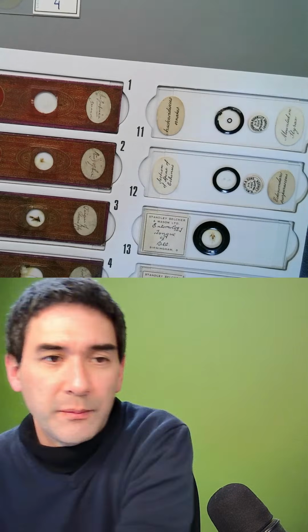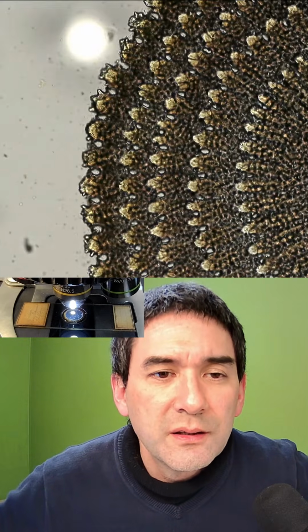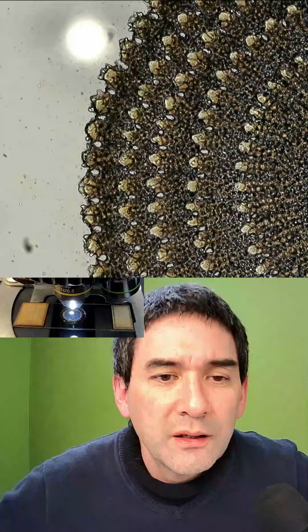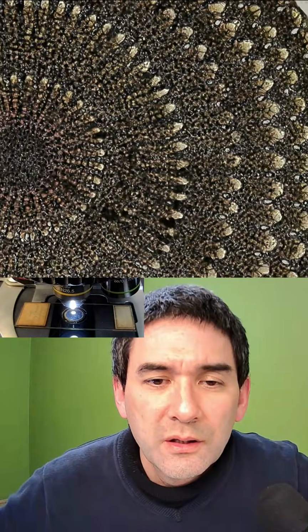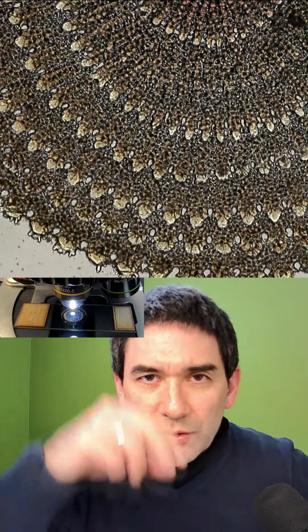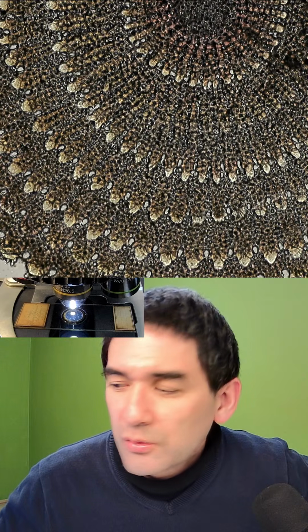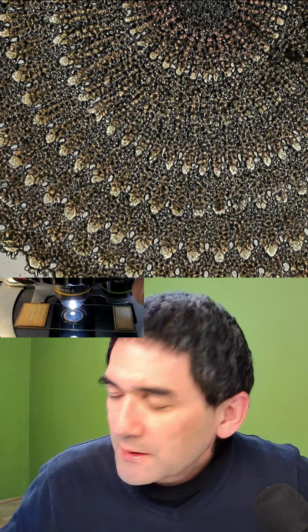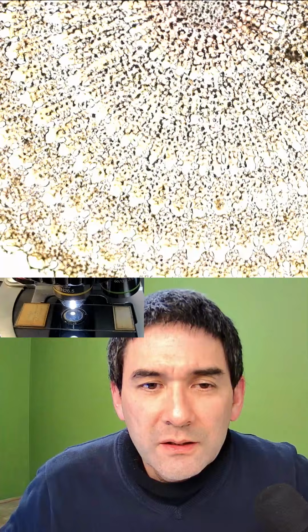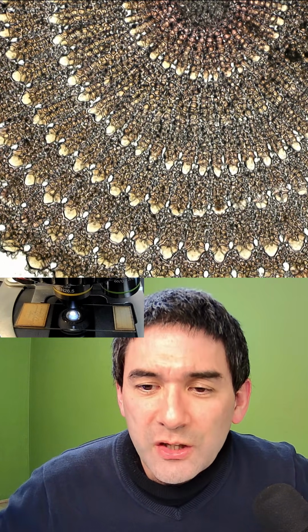Ah, yeah, here. That's one of them. That's actually one of them that I wanted to show you. That is the cross section of the spine of a sea urchin. A spine is one of those spikes. That's quite nice looking as well. So let's put it like this. Really nice patterns of nature.